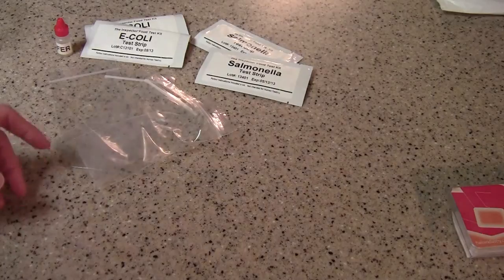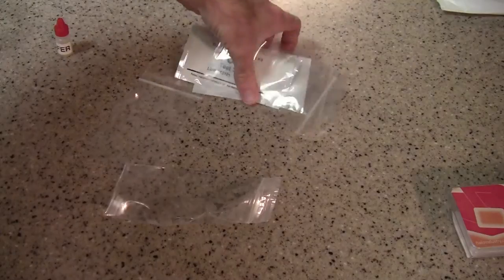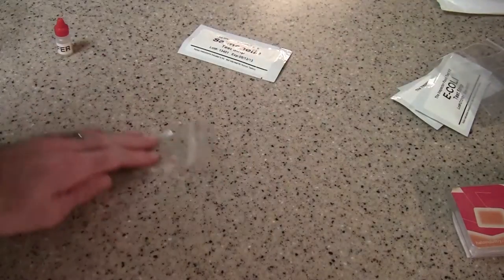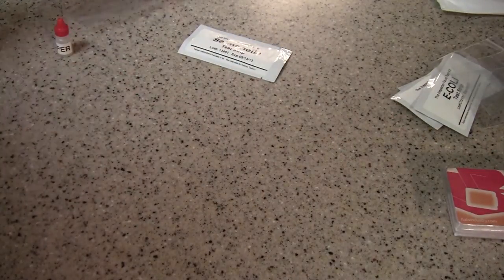So we're going to use a salmonella kit today. So I'm going to go ahead and put these other things off to the side. And the instructions are pretty straightforward. The instructions are printed on the inside of the package here.